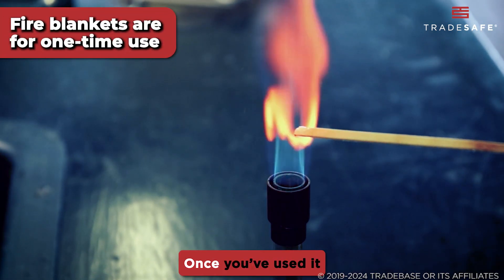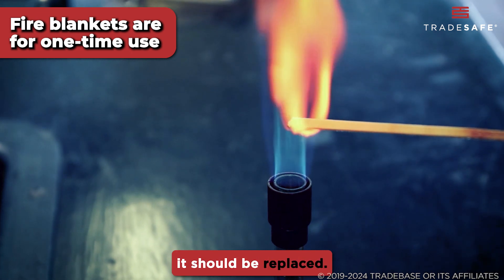Remember, fire blankets are for one-time use. Once you've used one to extinguish a fire, it should be replaced.